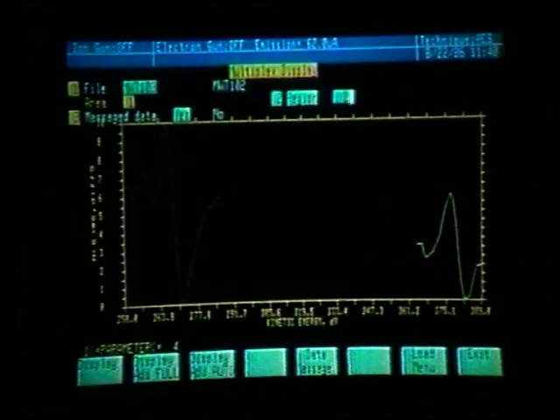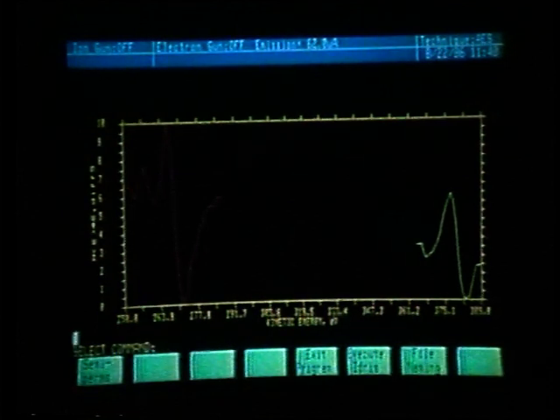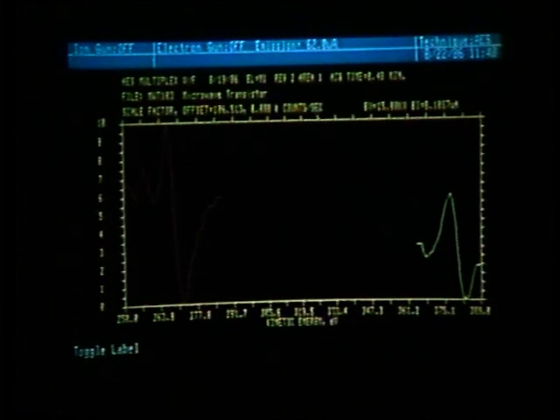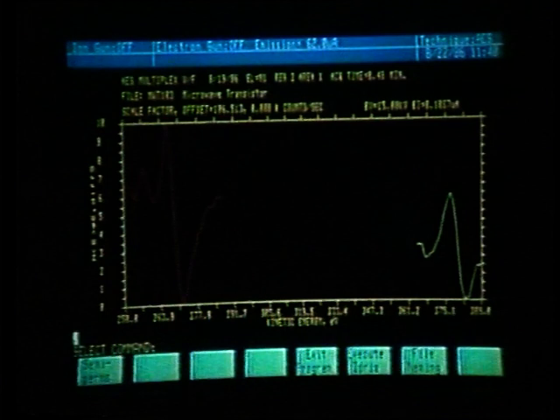What we can do now is exit from the multiplex display menu, striking soft key number 8. Let's toggle our graphics label back on, holding the shift key and pressing function key 14. Let's enter the data massage, function key 21, and soft key 5. And let's annotate this graph, soft key number 8.